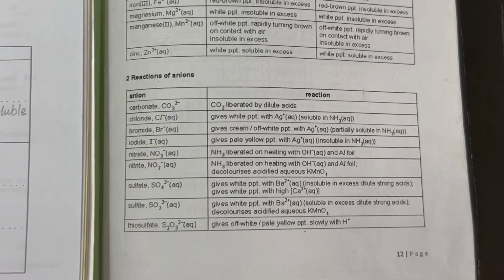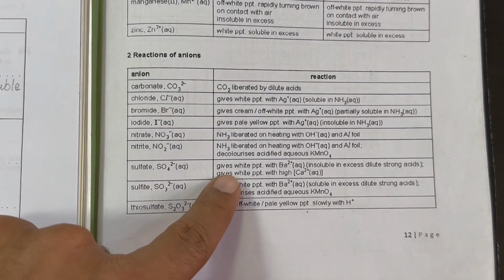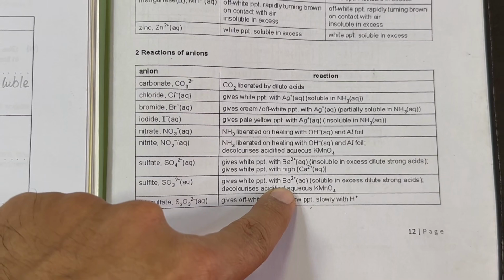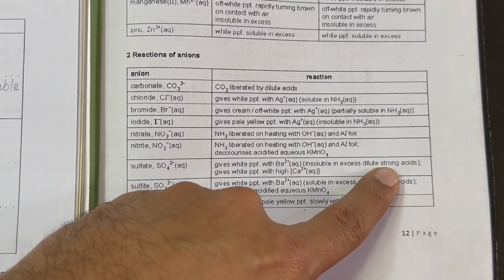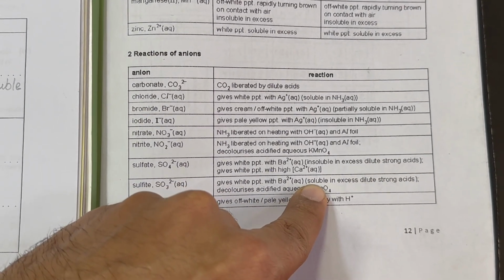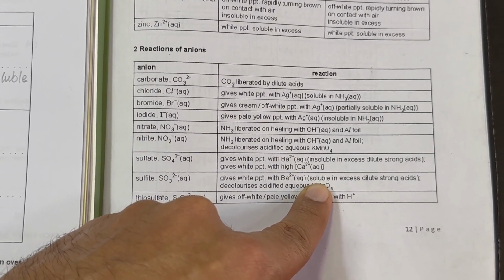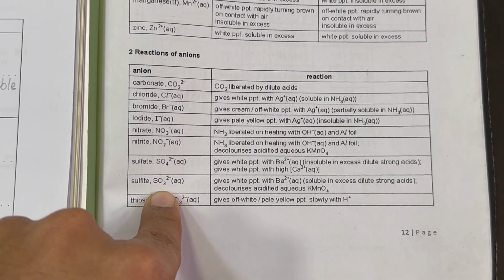In the table of anions, for sulfate and sulfite, we add barium nitrate, which gives white precipitates in both of them. But if we add dilute acid, those precipitates show variation either by dissolving, meaning soluble, or insoluble. In our case, the precipitates were soluble, it means sulfite is confirmed.